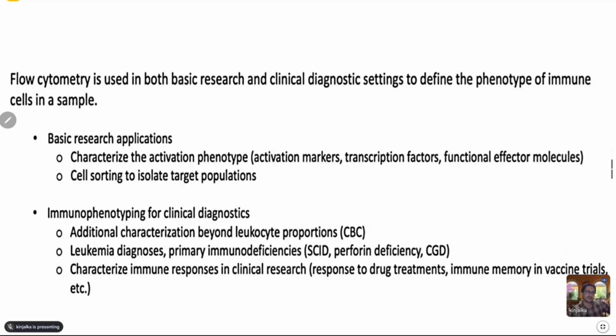Immunophenotyping remains the commonest application for flow cytometry, but along with that, you can also diagnose immunodeficiencies, characterize response to treatment, and identify and sort different subsets of cells to be used in downstream pipelines like cell cultures and so on. You can also do cytochemistry, like enzyme flow cytometry, where enzymes are expressed at the surface or in the cell. That is one angle where biochemistry can use flow cytometry to identify different enzymes, their isoenzymes, their locations, and so on.